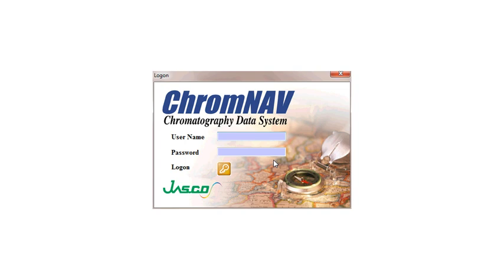After you have successfully installed it onto your PC, you can launch the software by double-clicking on the Chrome Nav icon on the desktop. Once you have done so, you will come to this login screen.